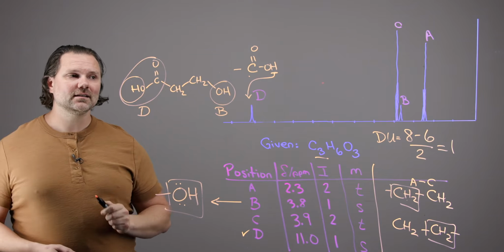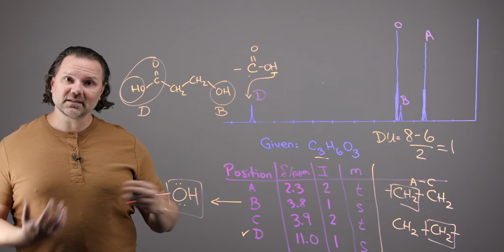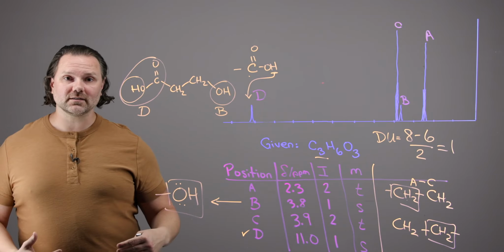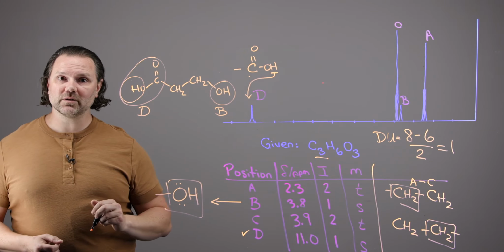In fact, alcohols in a solvent that allows rapid exchange of that proton in an acid-base reaction will not demonstrate spin coupling with the neighboring protons.